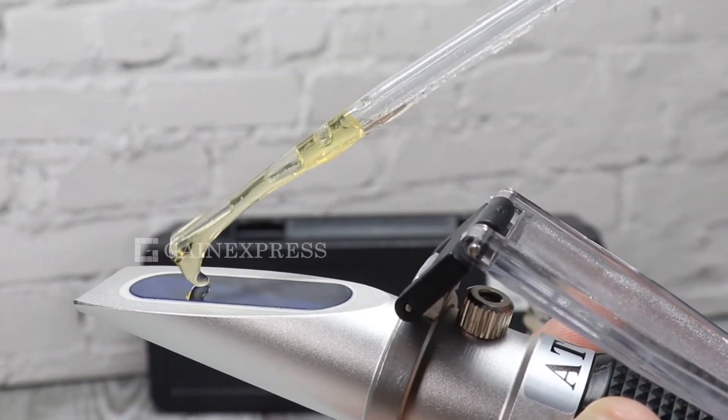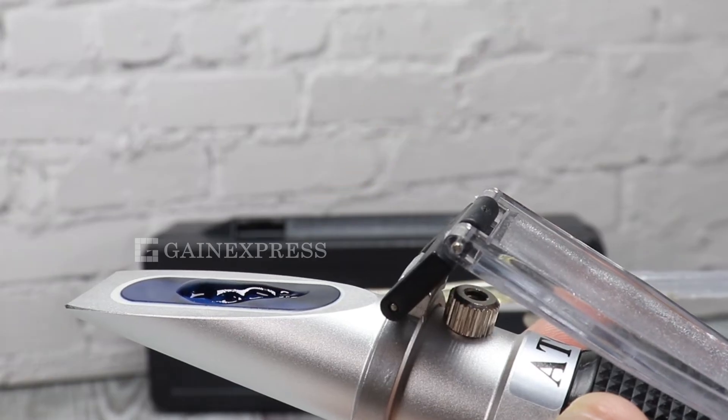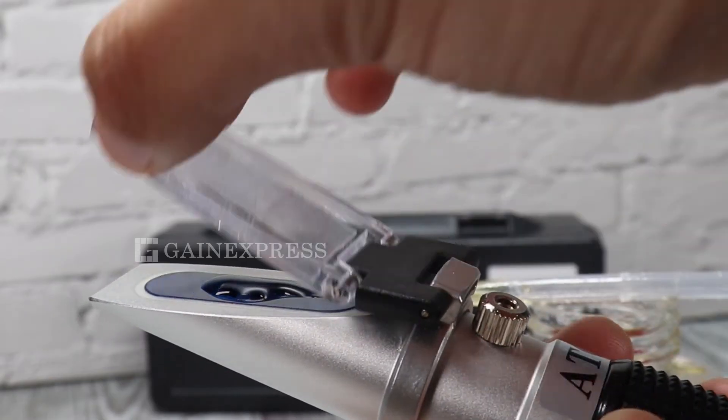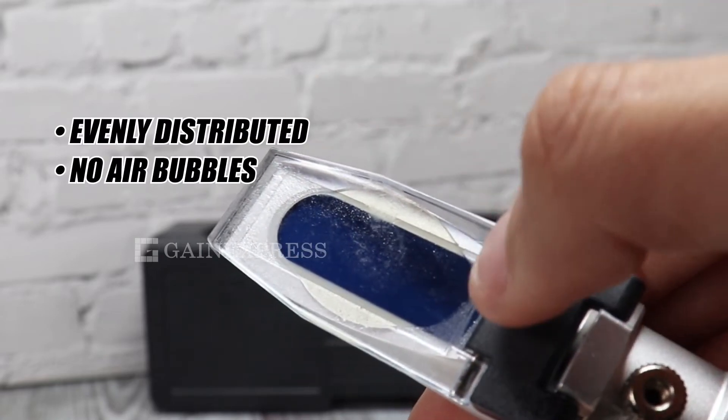Place a few drops of sample on the main prism and close the daylight plate. Make sure the sample is evenly distributed and there are no air bubbles on the prism.